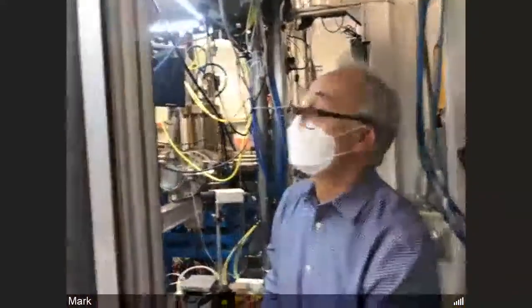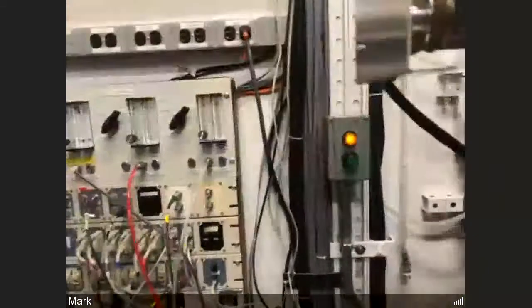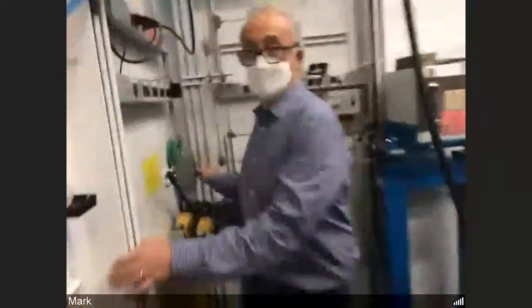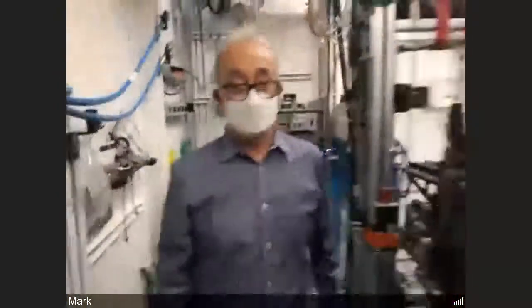This set of lights on the table can only be turned off from inside the hutch, so we have to remember to do that before we leave. And now I'm going to go search the hutch. So I press this button. Searching station D. And I make sure that there's nobody in here. Nobody's sleeping on the floor. Immediately press the second button, which ensures that I've looked in this end of the station as well.